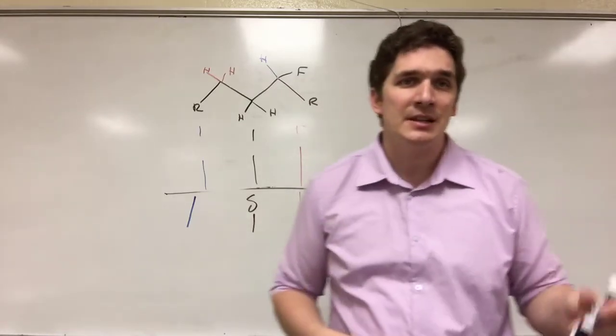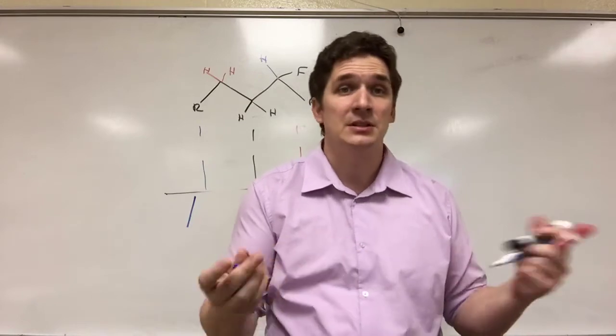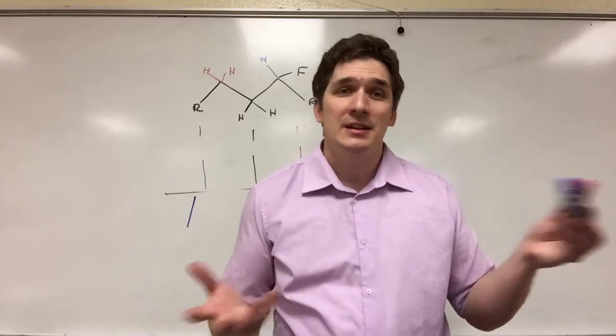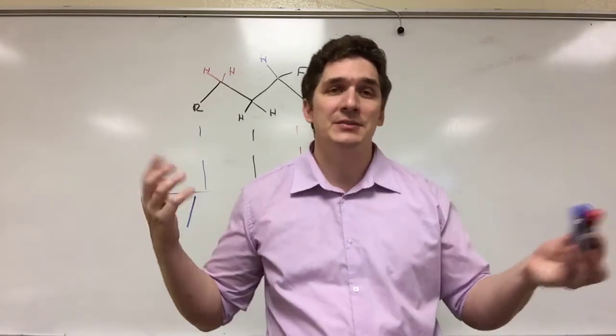So carbon-13 is a lot easier to analyze. It tells you the number of unique carbon positions, basically the number of unique carbon functional groups. And the way you determine that, look at the carbon atom, look what is around it. If you have two carbon atoms you think are the same, look what's around them. If it's not the same thing, they're going to have different chemical shifts.